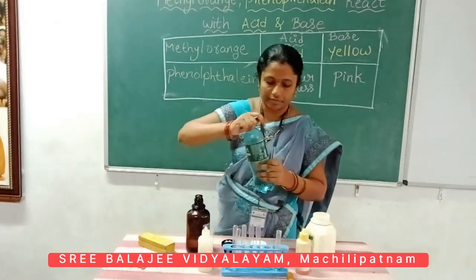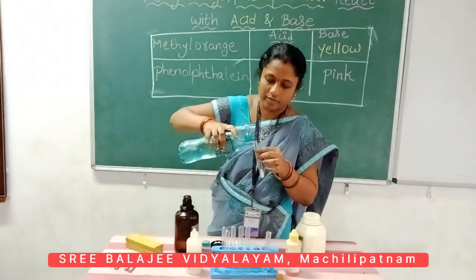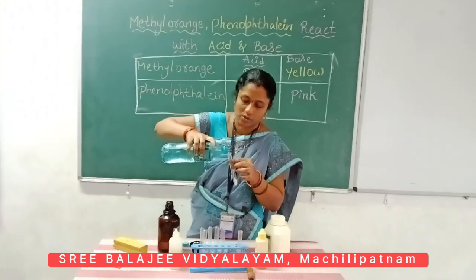Add some water, because the sodium hydroxide is in a solid state, adding some water changes it to a liquid state.